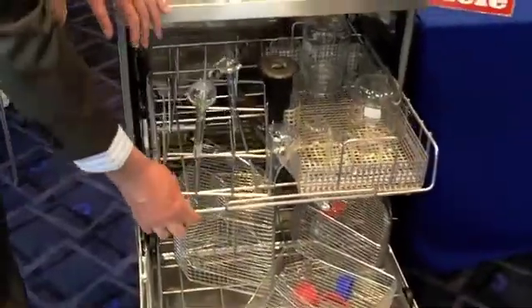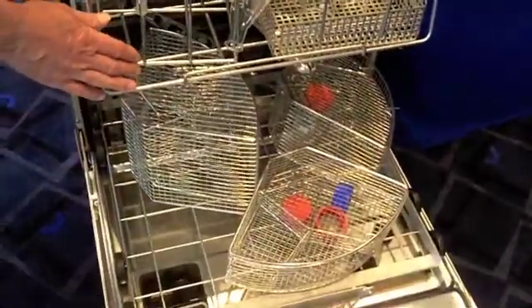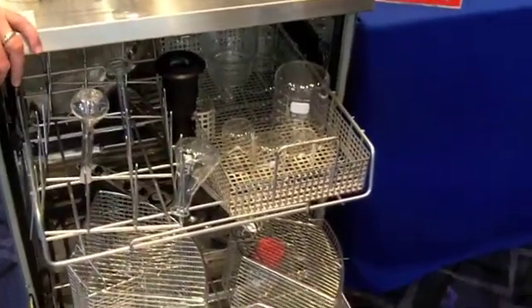I've got the machine set up with an open basket and a bottom basket. And accessories — I've brought spring clips and a B-cut basket.